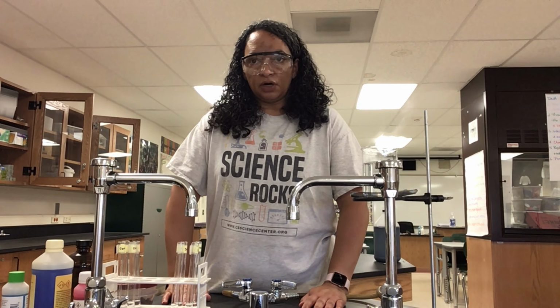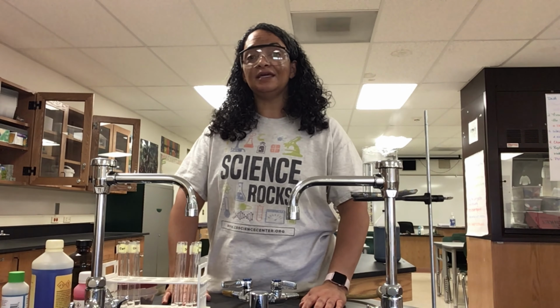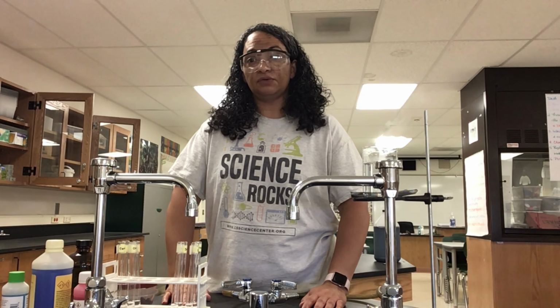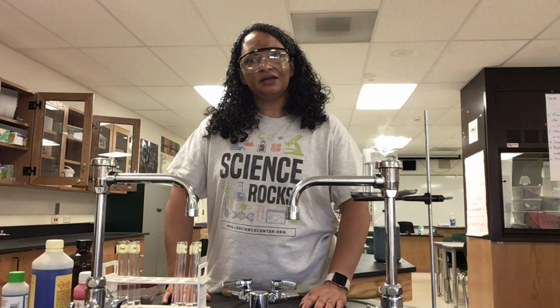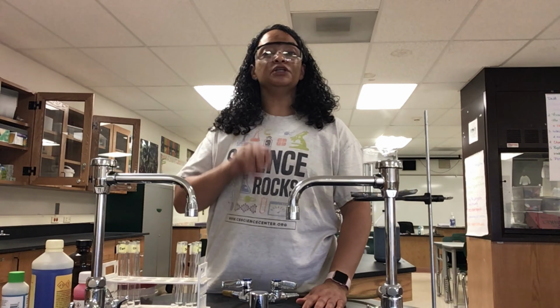All right, so what we're going to use today are 4 different indicators. So you've used an indicator, or we've used indicators before when we used bromothymol blue, or BTB. So if you remember in the yeast lab, we used it to show that the yeast was making carbon dioxide. And then we also used it in the Elodea lab, the photosynthesis and respiration lab, which we may not have gotten to yet. But whatever, you're going to use it again. BTB. We're using 4 different indicators today.